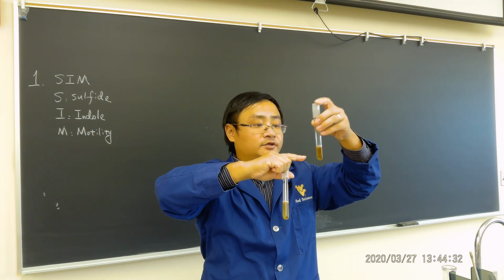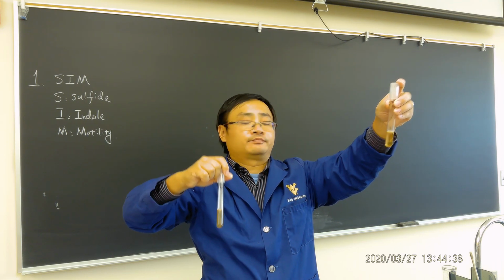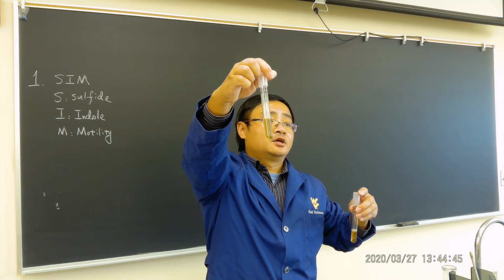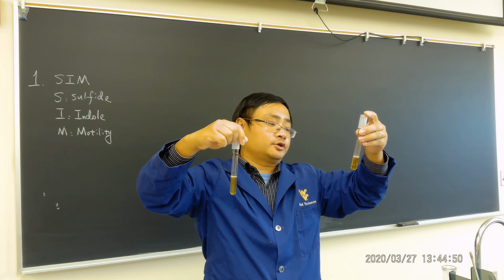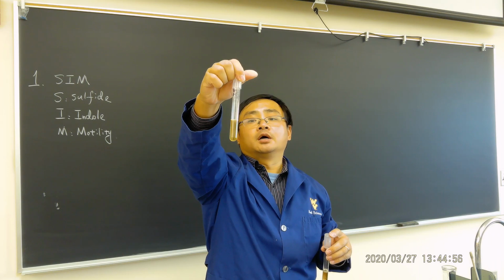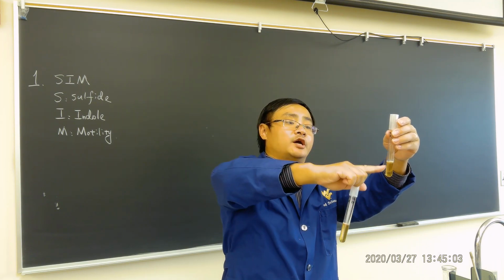We could see that it did not really turn black, but there's a little bit of black showing here for Proteus vulgaris. This is Pseudomonas aeruginosa. Most likely it's not black. The temperature may be the reason, because we kept it at room temperature. It might be another reason. You can see this Pseudomonas aeruginosa is not black, and this one is slightly black.